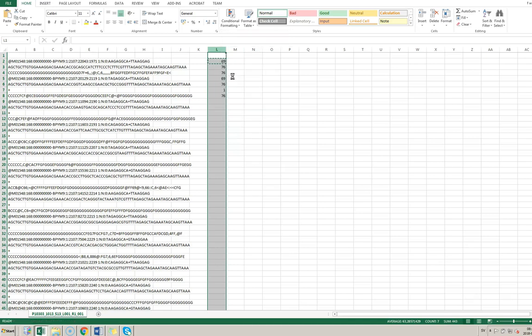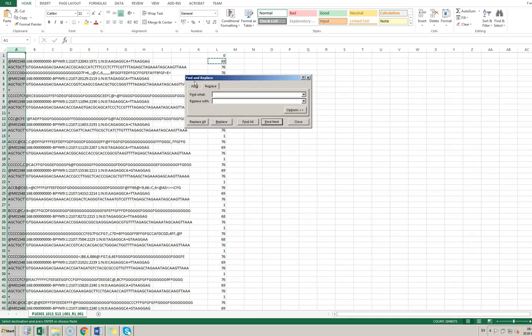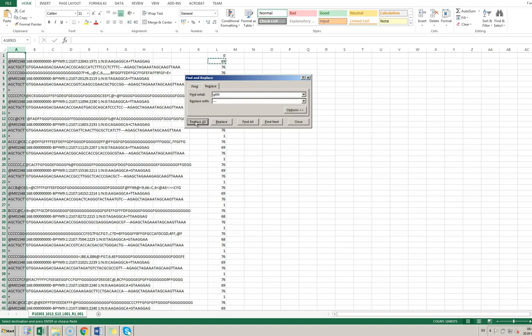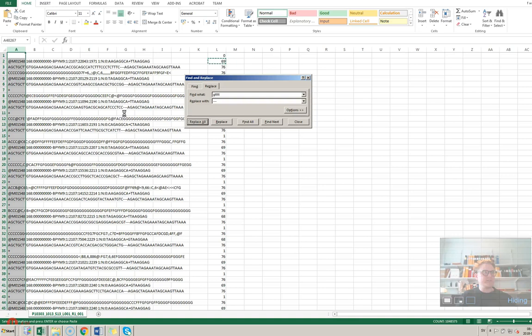When I paste the LEN formula across the whole row, you'll see quality data is 76 and text rows are 69, while 76 corresponds to the read sequence. To get around this, I'm going to use Find & Replace — we know 'GTTTT' is the end of the guide RNA, so I'm going to replace that 5-character sequence with a 3-character version. This will mark where the guide RNA ends, which is what we're interested in.